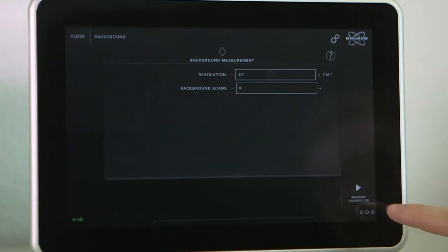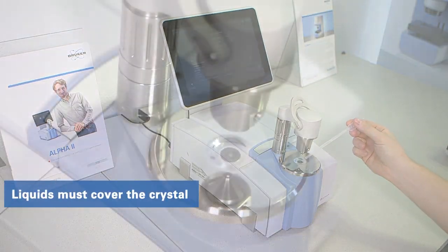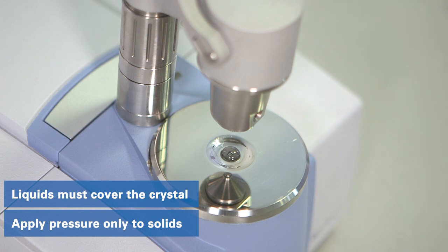Before, make sure the crystal is clean and use rubbing alcohol and soft tissues if cleaning is necessary. When FTIR is used, liquids and oils are directly applied to the crystal. Assure your sample covers the diamond entirely and apply the pressure stamp only for solids.